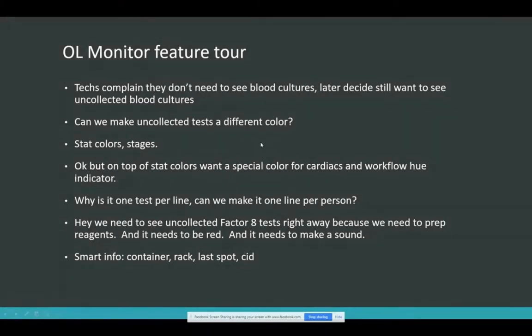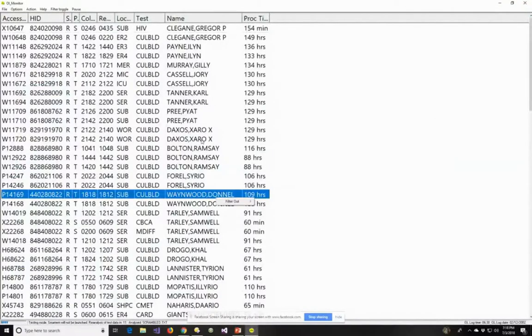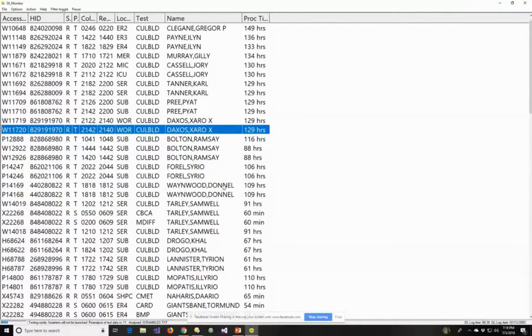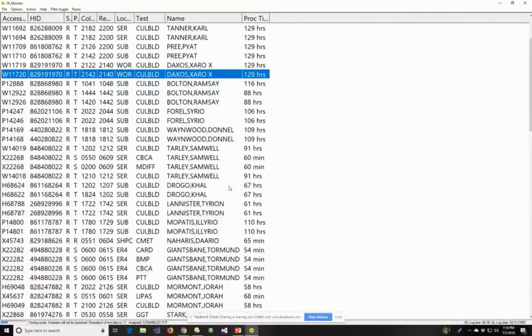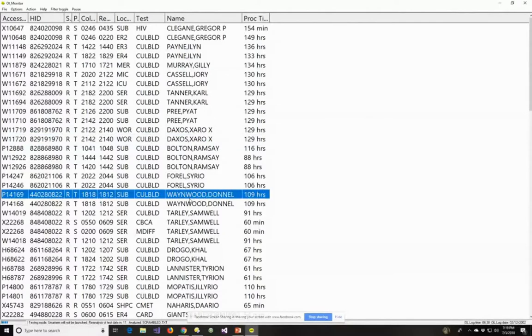Let's go ahead and get on to how to use this — get out of the presentation and play around in here. Here it is. This has been running for a minute — we're in test mode here and looking at some test data. No PID in here. We've got our list, and it's a lot easier to read than your average printout. You can change the font and colors to make this look perfect.